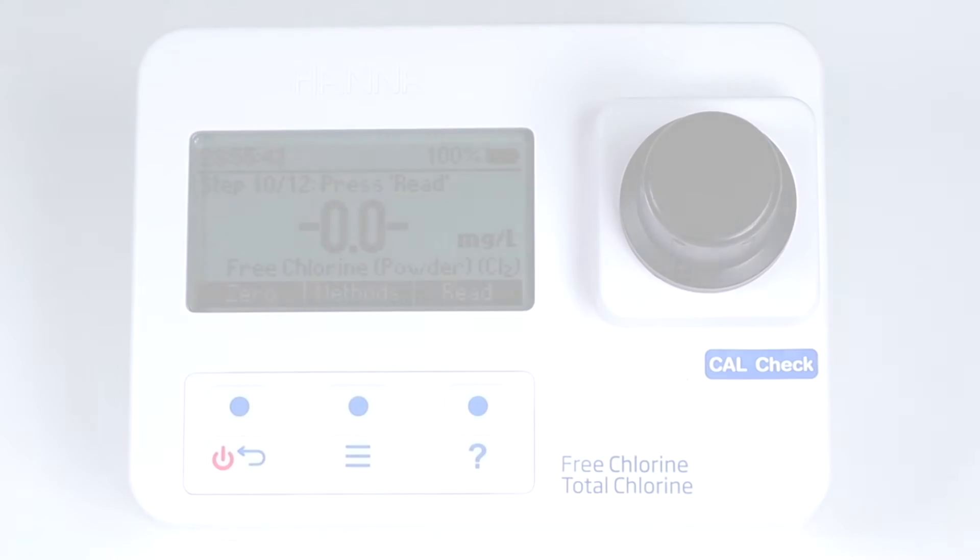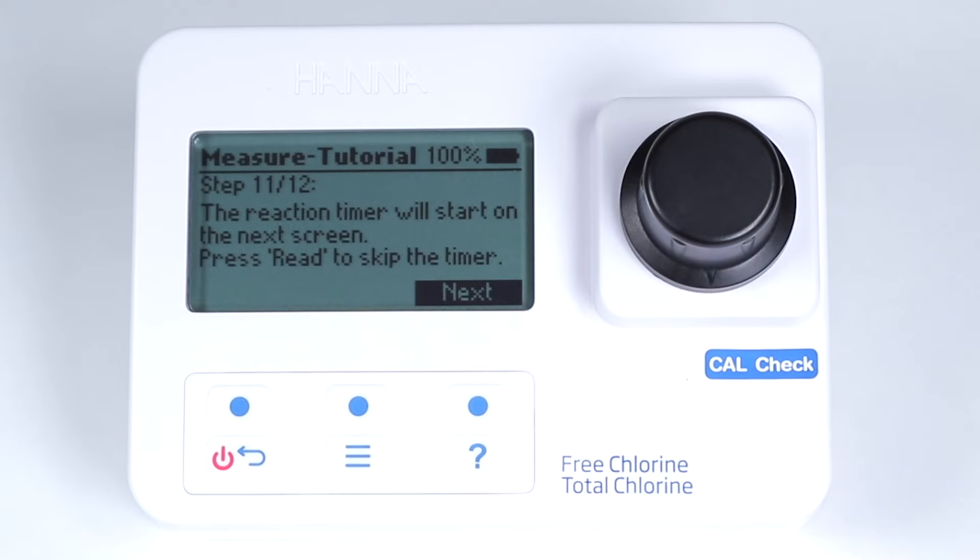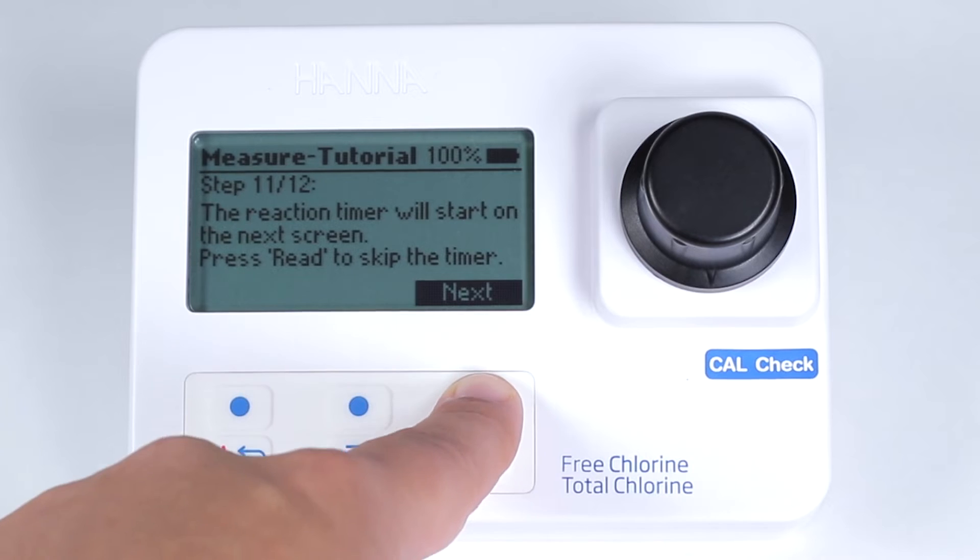The photometer has a built-in timer that will count down before the meter takes a reading to ensure consistency in testing with different samples or by different users.